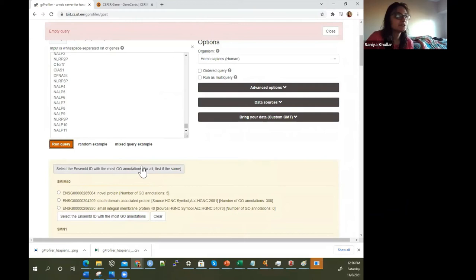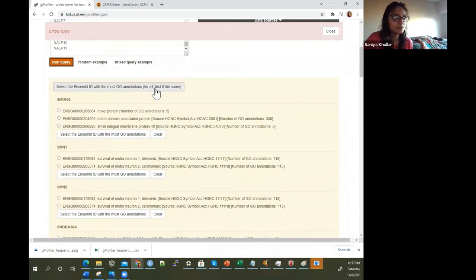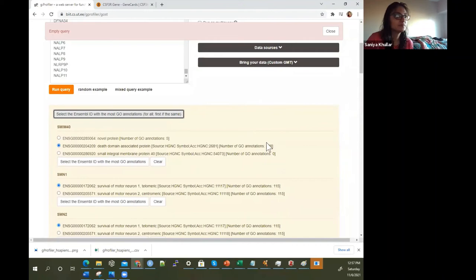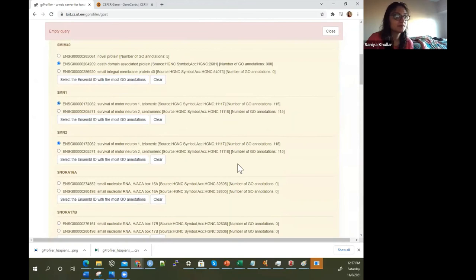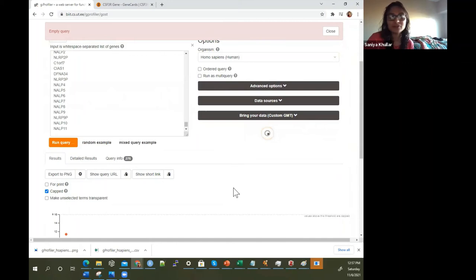When running a large list, you may get a message saying there is ambiguous information for a given ID — genes can have different Ensembl IDs. So you can choose to select the Ensembl ID with the most gene ontology annotations. For example, this one gives you 308 annotations, this other one gives you five. It selects the first among tied ones. Those with zero are ignored as it figures out which Ensembl IDs you'd want.